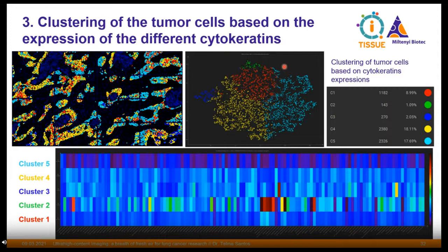And here you can see clearly where these clusters fall. So cluster 1 here, cluster 2 here, cluster 3 here, and so on and so forth. Then I plotted these clusters in a heat map, again to have an overview. One example here is that clusters 1, 4, and 5, which are the biggest ones, do not seem to have standouts, but it might be due to the fact that these two clusters, because they're very small, stand out better, and then kind of make the other differences not as visible.